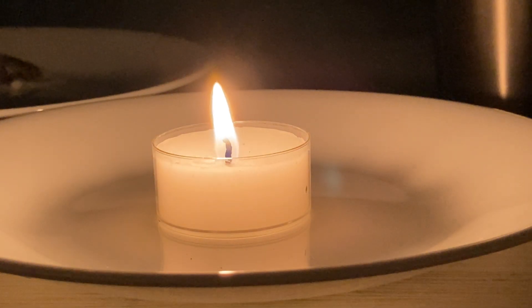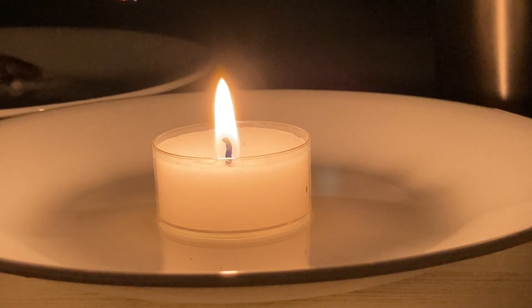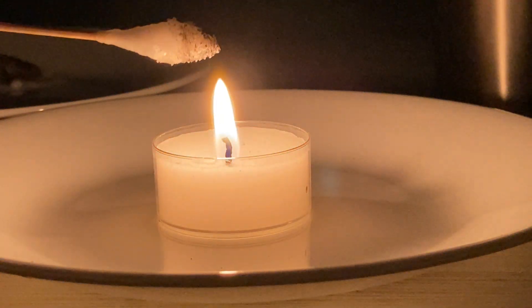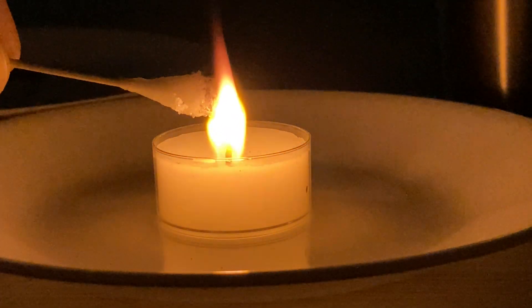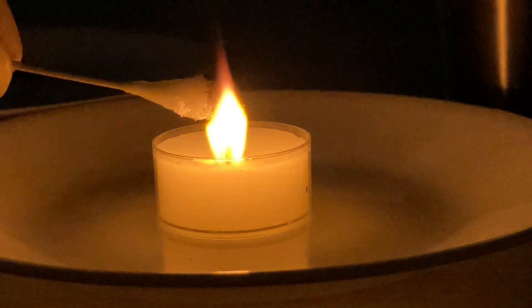And then again here's the table salt. You can definitely see the orange — wow, I can really see it here. That orange is very clear. Okay, take it off.